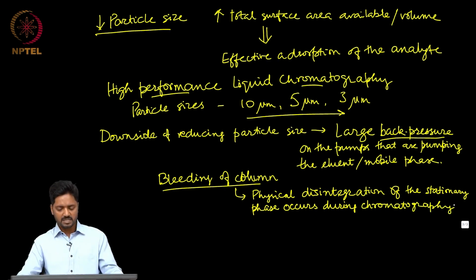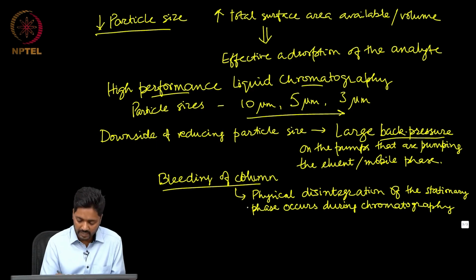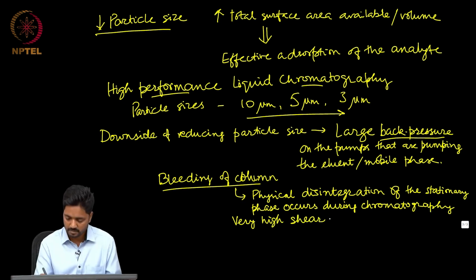So, you need to understand that when the mobile phase is pumped into the column which is tightly packed with the stationary phase, what we observe is that this moving of the solvent or the mobile phase generates very high shear forces.